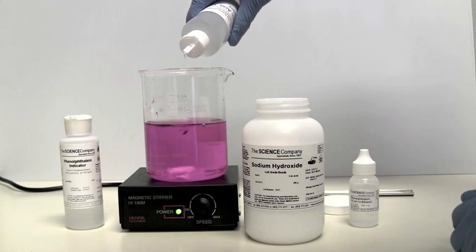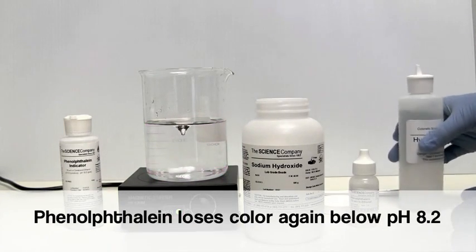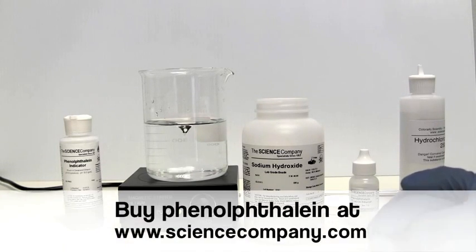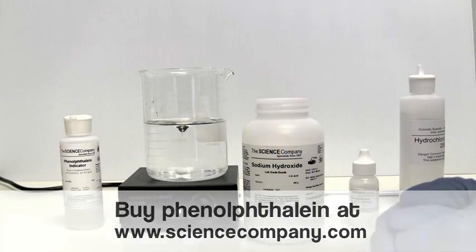As we add acid to our solution, we drive the pH below 8.2. Watch as the solution becomes clear again. The reaction from pink to clear and back again is completely reversible, making phenolphthalein an ideal pH indicator in the 8.2 to 10 range.